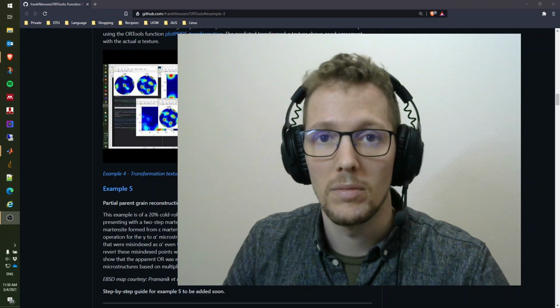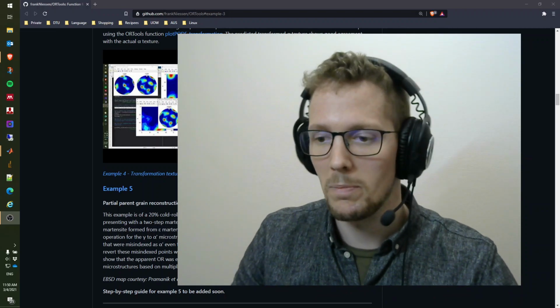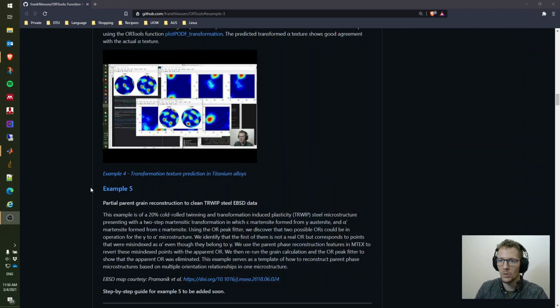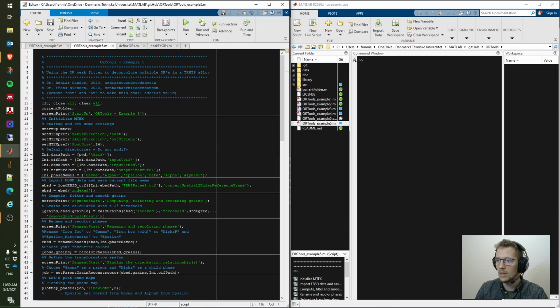In this kind of data set, there are a lot of different orientation relationships, and we're going to look at one or two of them and distinguish them. But I think we're just going to get started, and then you'll see what I'm up to. So again, as always, you can find example 5 on the main page of the ORTools toolbox right here. Let's jump into MATLAB. If this is your first example video, please start with example number 1, where I go a little bit more into the tiny details.